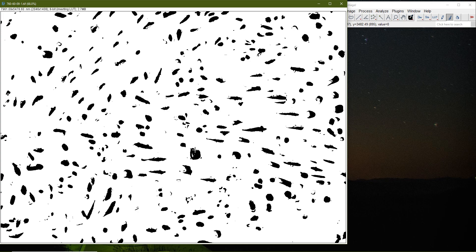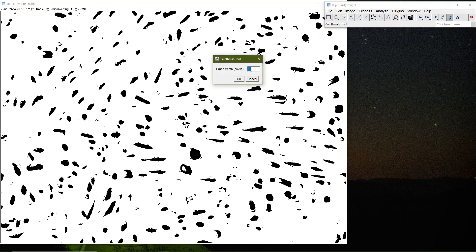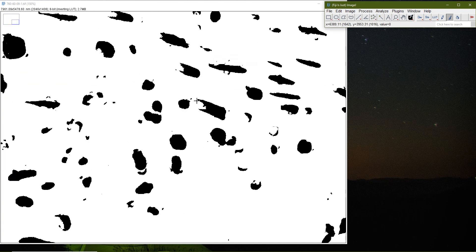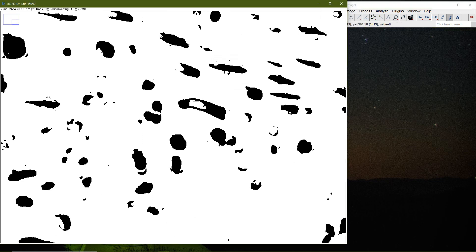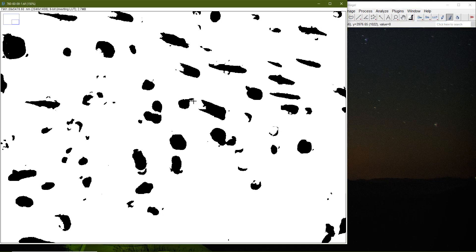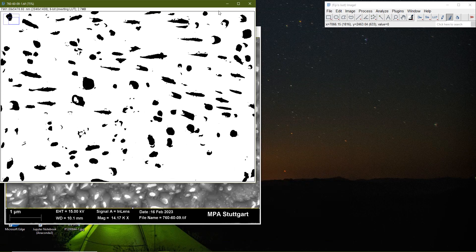I basically just reconstruct the particles — I close the loops manually. I can right-click to change the brush size, say to five, then zoom in and fill in the gaps. This is just to give you an idea. Eventually I'm happy with this image.